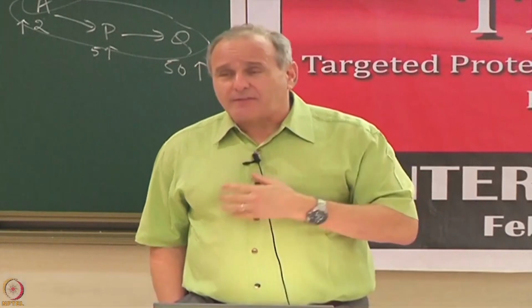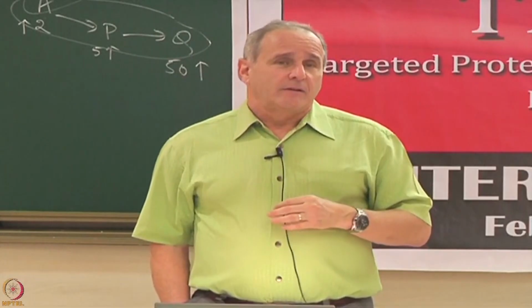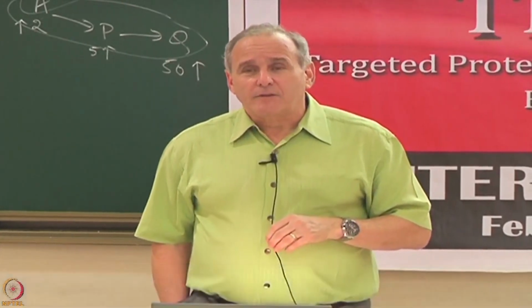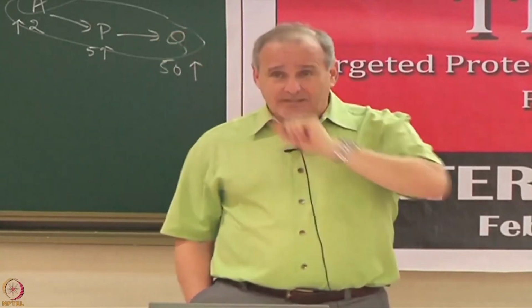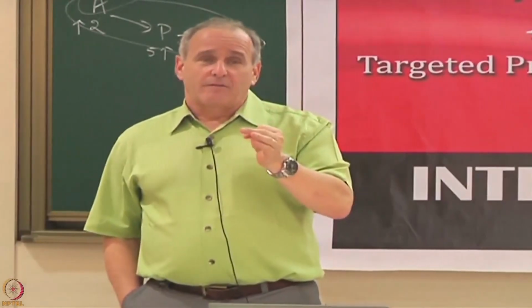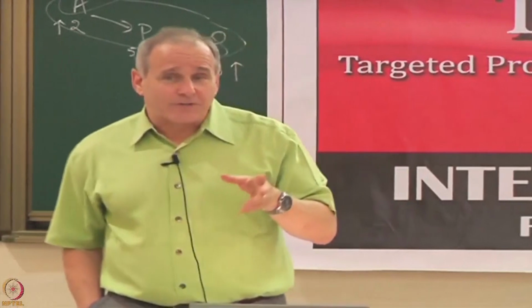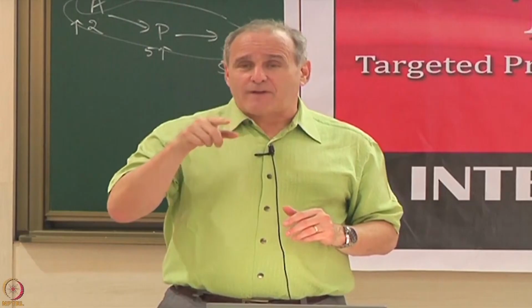You could look at that. The problem is that for most proteins we don't have the functionality. What other ideas have we got? You could certainly test them one by one in the mix. In the mix. That's how we went about it, right? So what we did is we said, well, let's make mixtures of proteins for which we have antibodies. So in this case, we're testing only proteins that we can come back and test. And then we're going to ask the question, if I mix a bunch of proteins together, if I test it, will I find the protein?